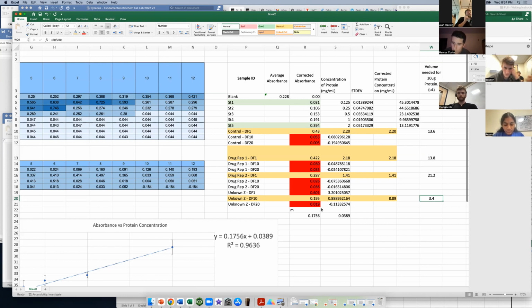The Tuesday labs, I uploaded fixed data by subtracting the noise introduced by the sucrose. So basically the standards used PBS as a diluent, and then these had the lysis stuff, and the contents of the lysis stuff gave us a false positive. So that's why you're supposed to make your standards also with the same solution you make your lysis buffer with.